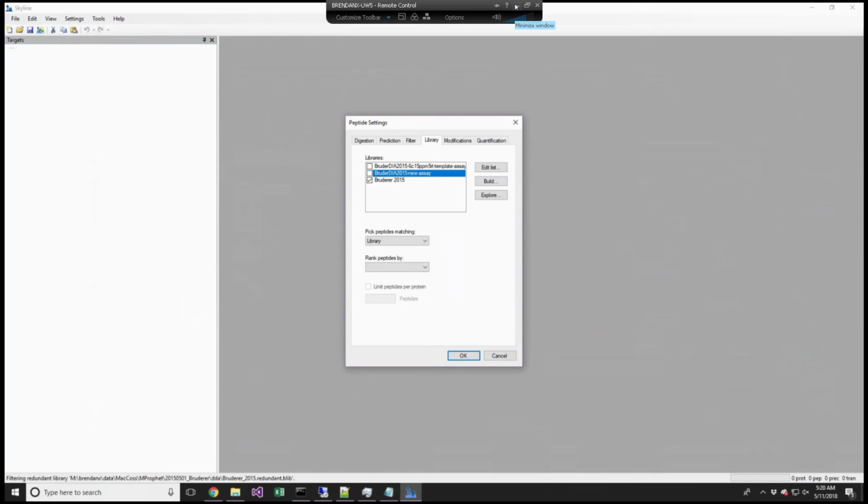But yeah, I think that's still a good manuscript because it talks about how to set up the instrument, what kind of samples to use, and then it even maybe gives some suggestions. So again, their end product is one of these types of assay libraries, right? It's actually an Excel spreadsheet.